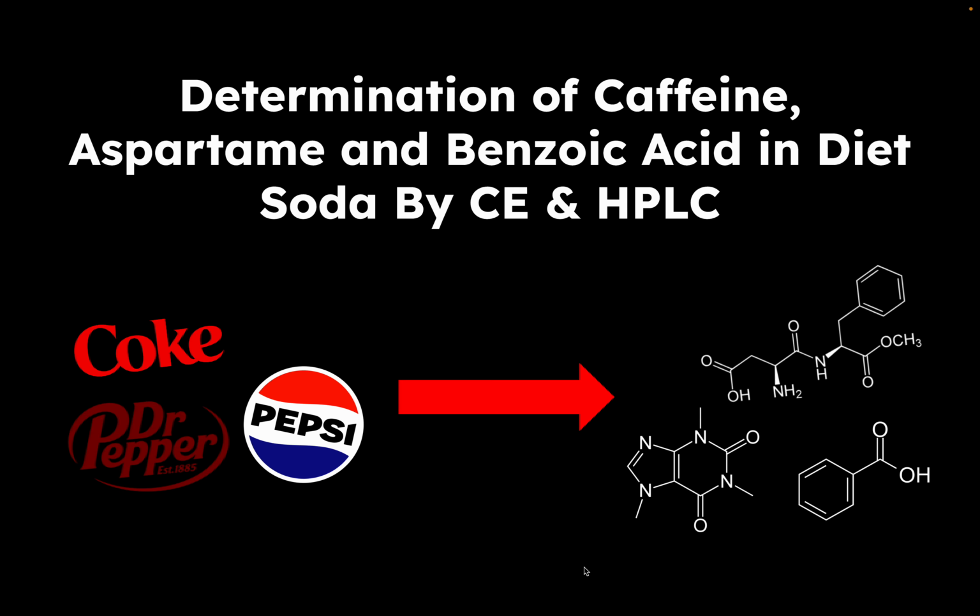This is a project that I did for my junior level instrumental chemistry course, and it follows determining some analytes in a diet soda beverage by capillary electrophoresis and HPLC methods.